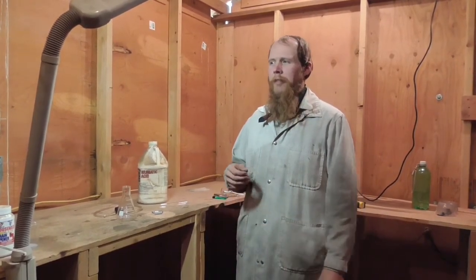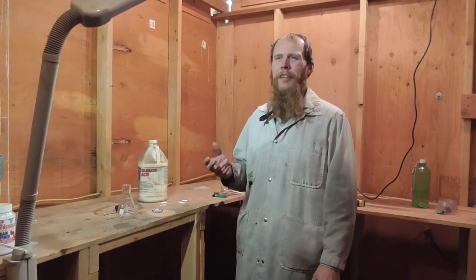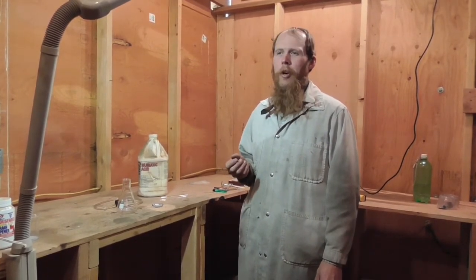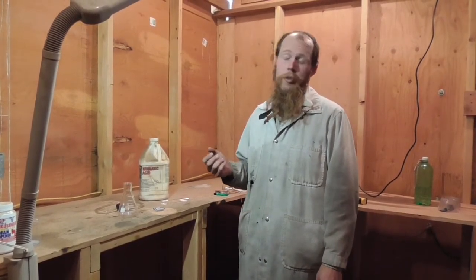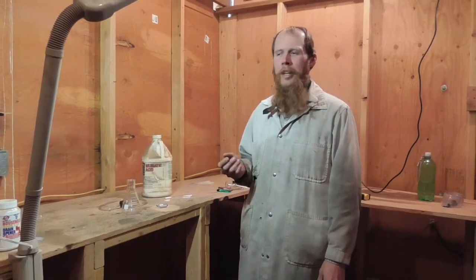Good afternoon and welcome to the Idahoan Show. It seems like whenever people talk about needing to generate some hydrogen for a chemistry experiment, everybody always defaults to electrolysis — cracking water to produce hydrogen and oxygen. Well, yes, that is possible, but electrolysis of water takes an awful lot of electricity to generate a meaningful amount of hydrogen, or oxygen for that matter. So if you just need small quantities of hydrogen for laboratory experiments, there are easier ways to generate it.